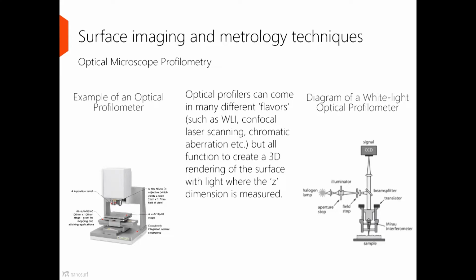You can see here, there's an example of a white light profilometer on the left. It looks a lot like an optical microscope. And here's the working diagram of one example of a white light optical profilometer, in fact, an optical interferometer here on the right.